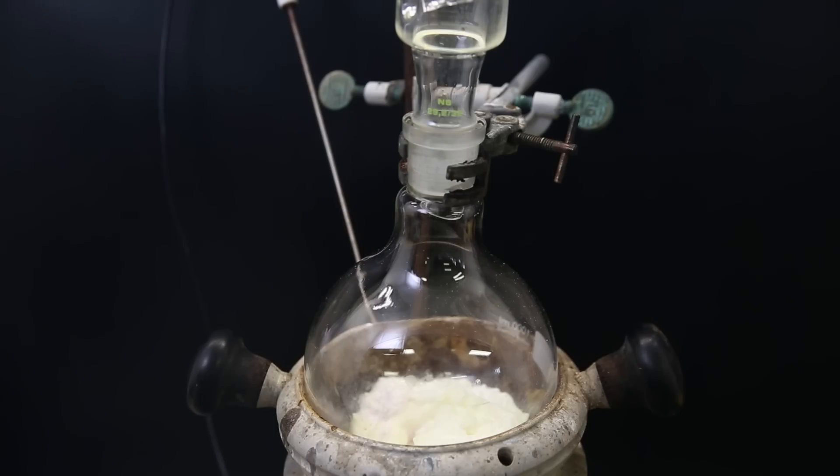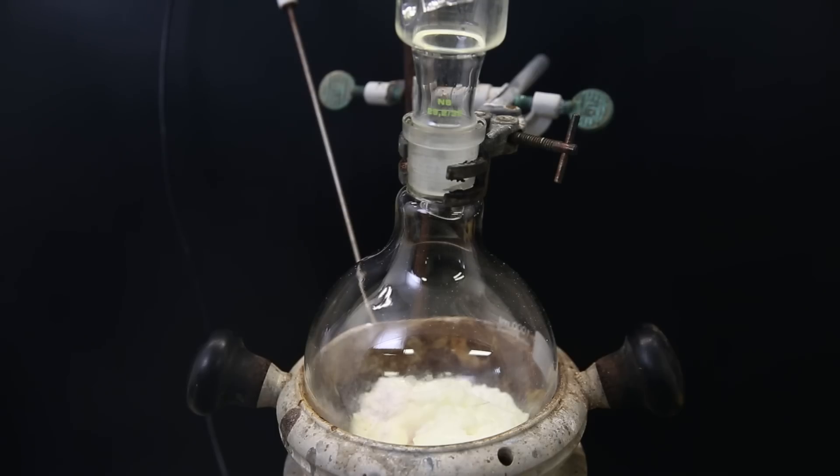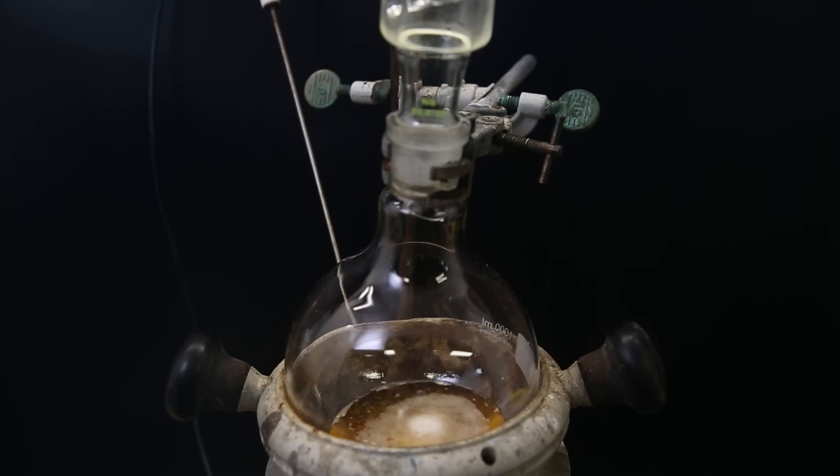I now attach a condenser and heat it to a reflux, causing the mixture to gradually liquefy and expel a lot of hydrogen chloride. After the initial gas formation, it calms down and it is now a bubbling orange-yellow liquid. I then leave this to stir and reflux for two hours.